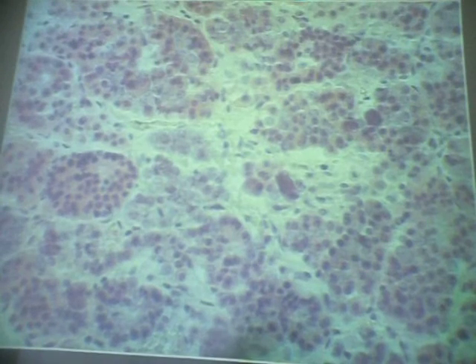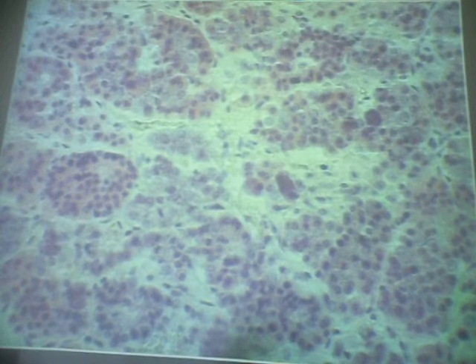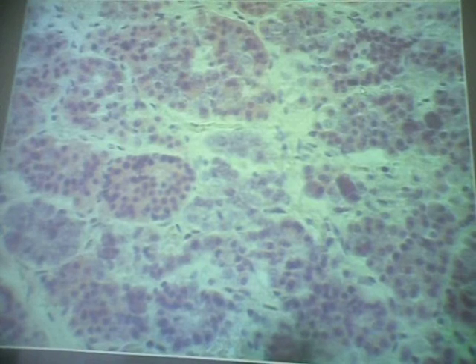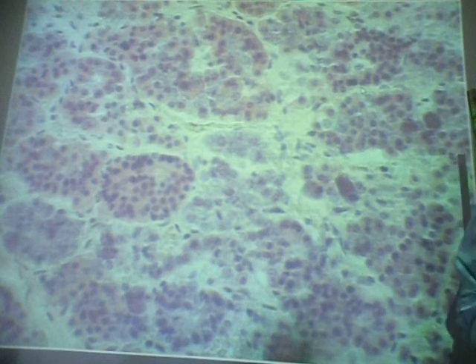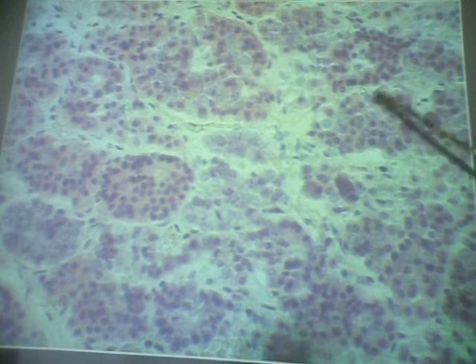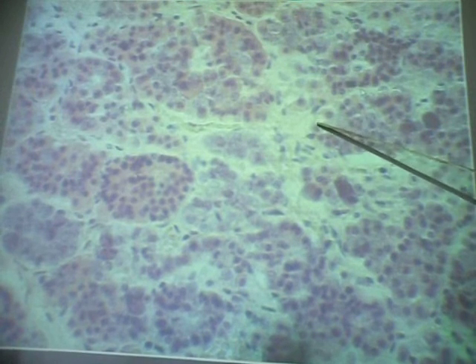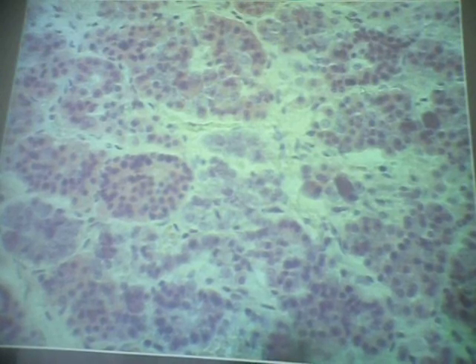All right, there's a third cell type here. It's not as common as the basophils and acidophils, but they are here. And these cells are called chromophobes. Chrome or chroma refers to color, phobe means fear. Okay? And here's one right here. These cells have a prominent nucleus, you can see here, and they usually have an unstained cytoplasm, or it appears somewhat gray. They don't like the color, chromophobe.